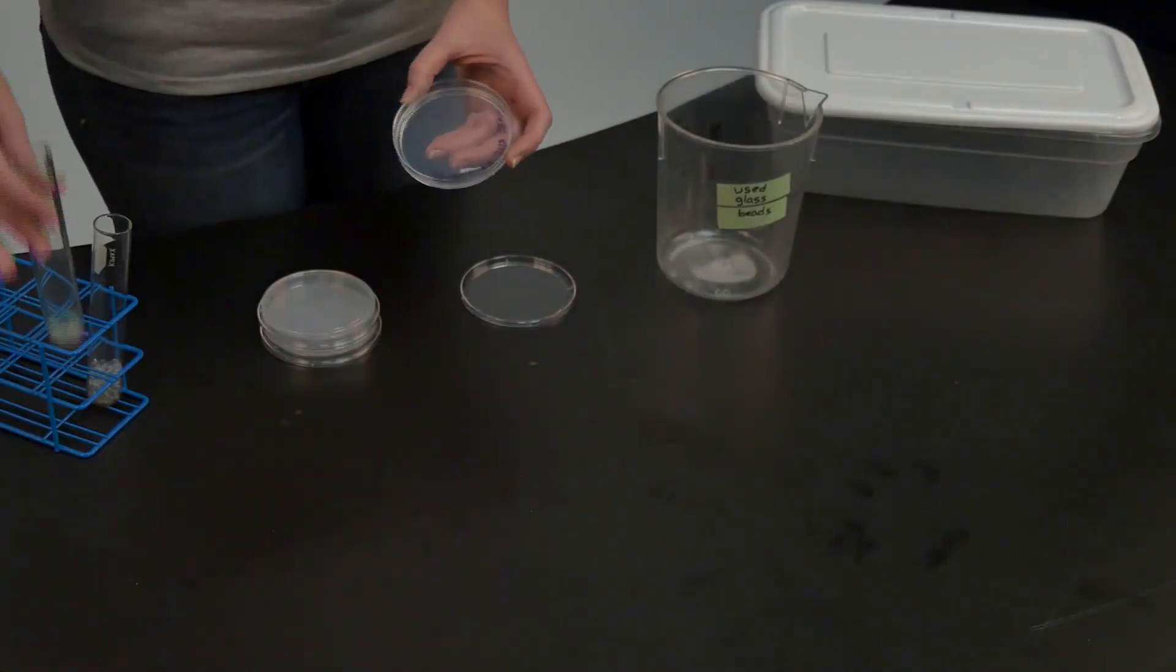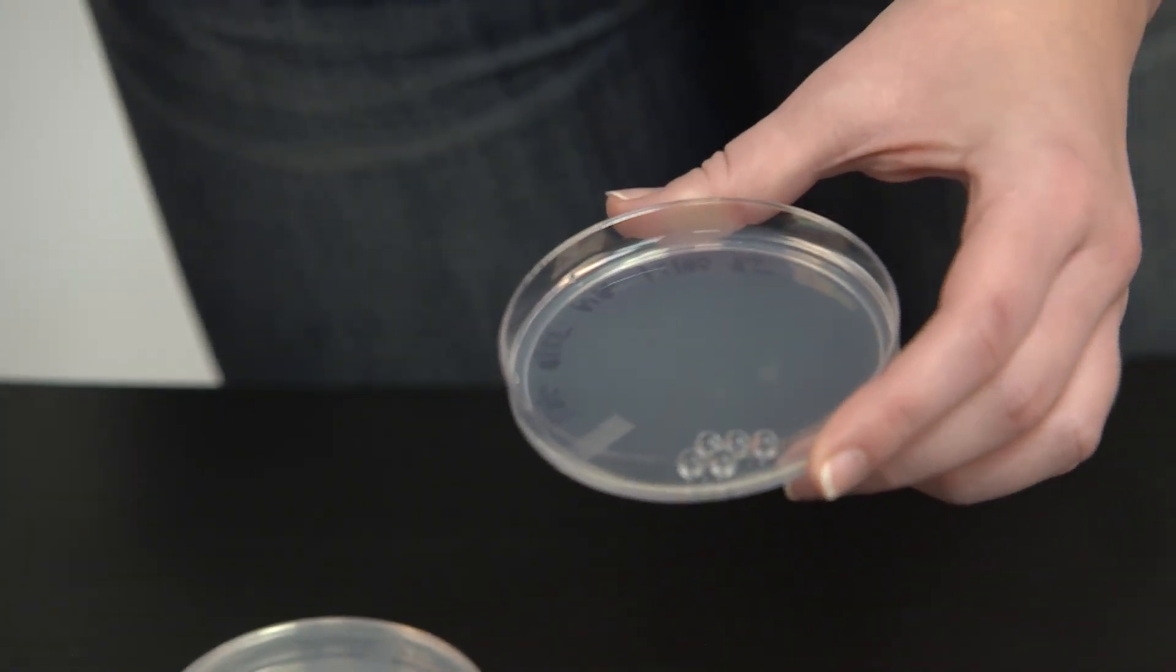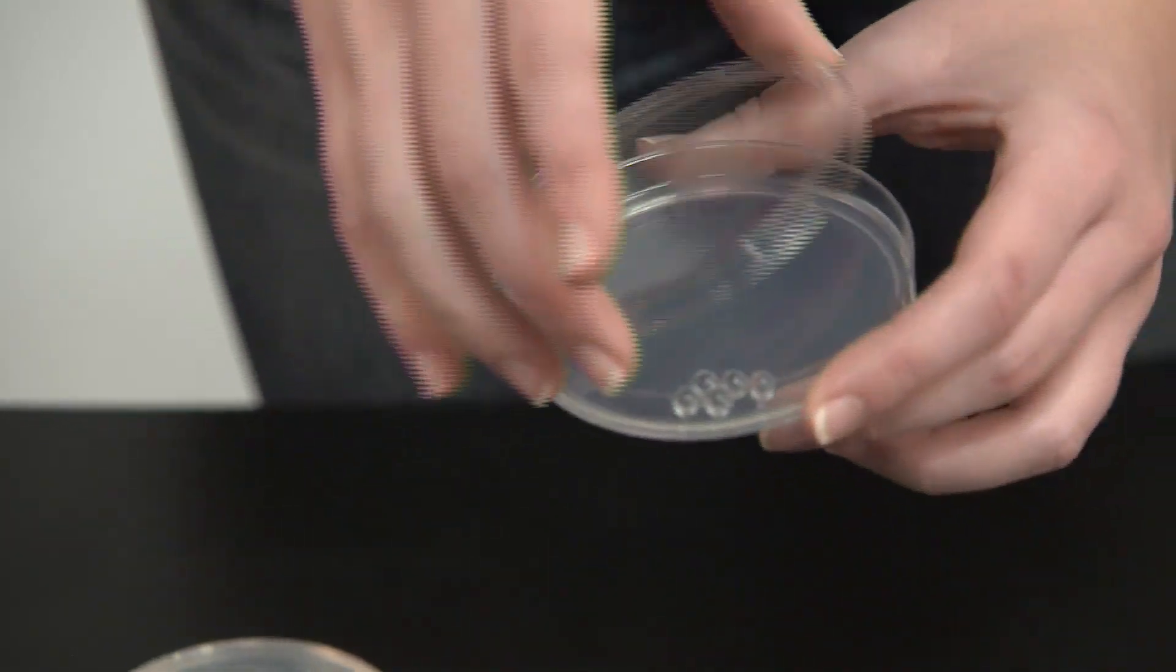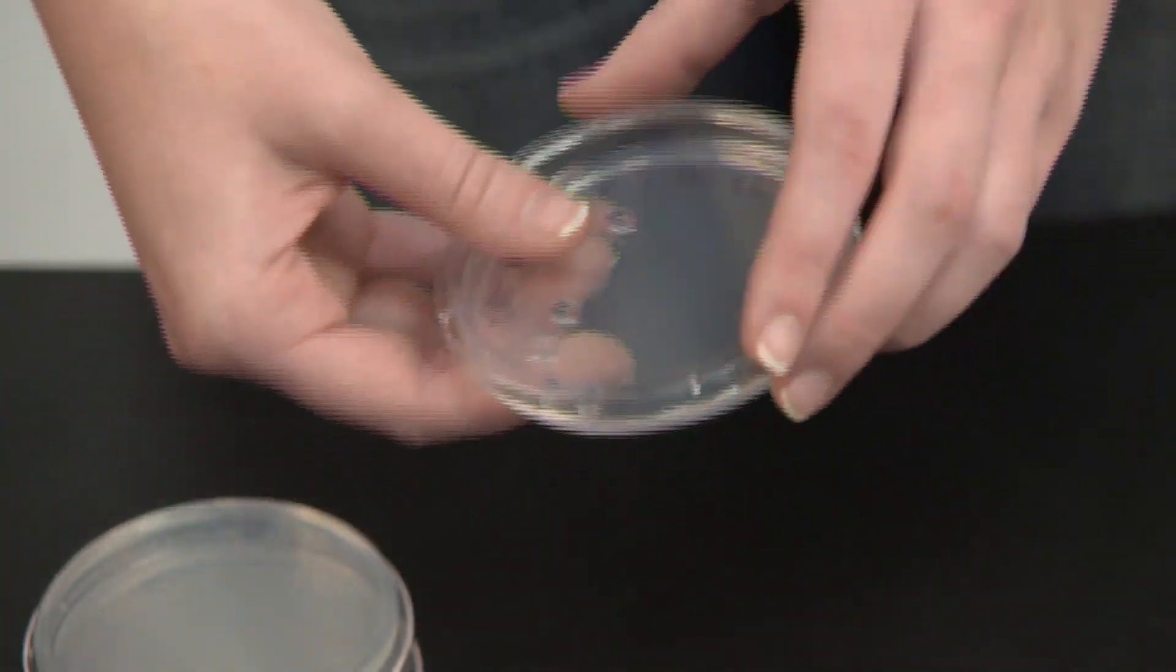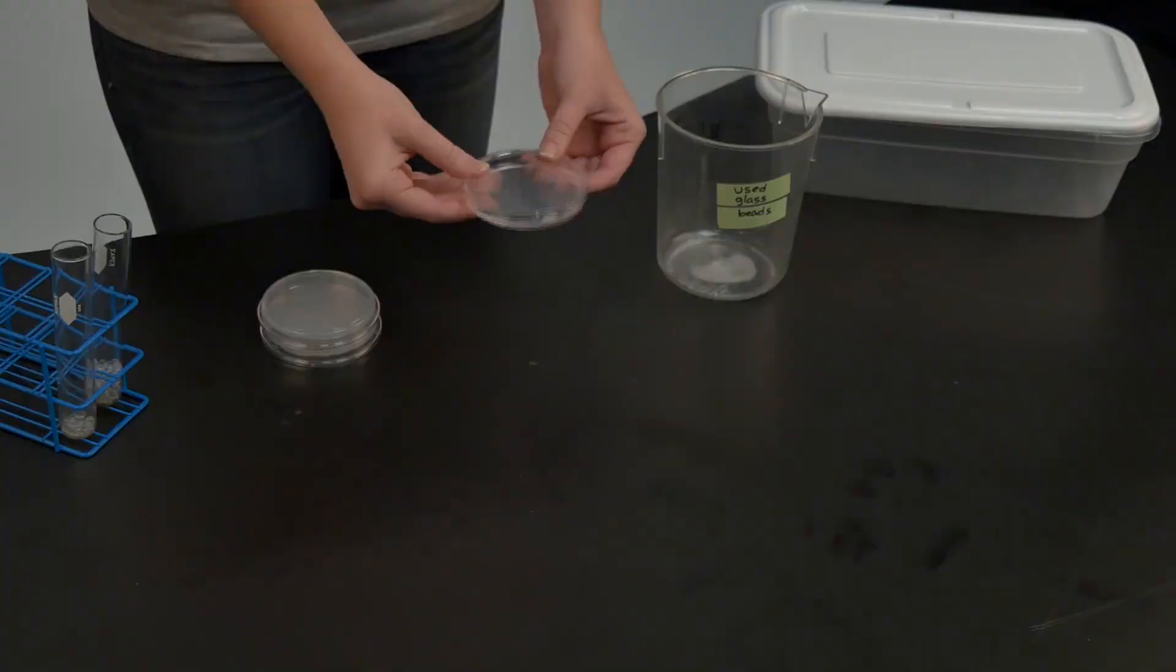Use 5 to 10 sterile glass beads to spread your sample on the agar plate. Replace the lid and then swirl the plate so that the glass beads spread the bacteria to all parts of the petri dish. Pour the glass beads into a container so that they can be sterilized and then used again.